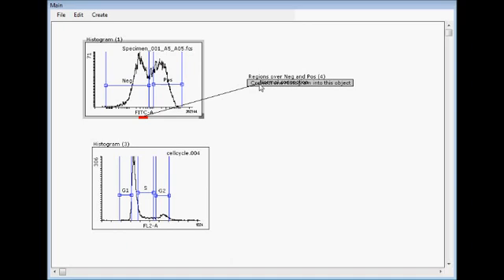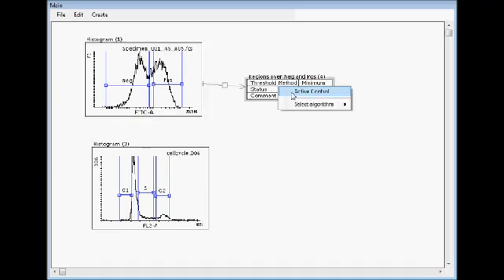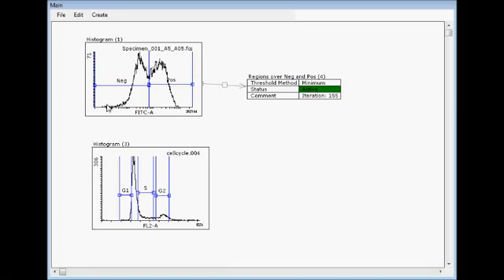Now I connect it here, and when I activate the control, it took control over these two populations and calculated the threshold between negative and positive populations and put the gate according to that. And if I jump to the next file in the directory, you can see that the gates are also moving. So this is a way to automate the analysis.